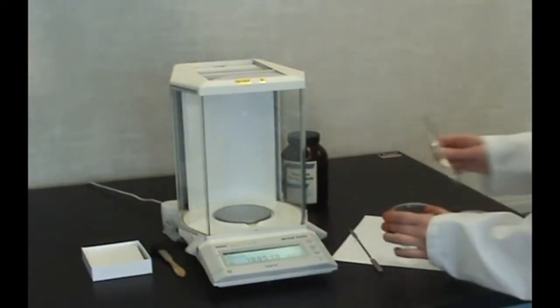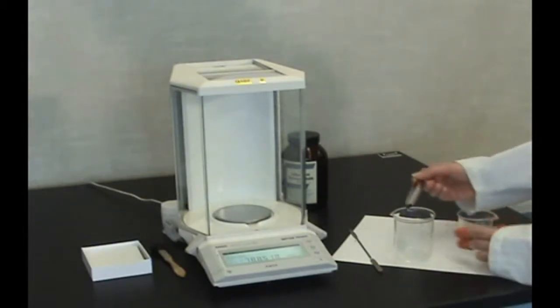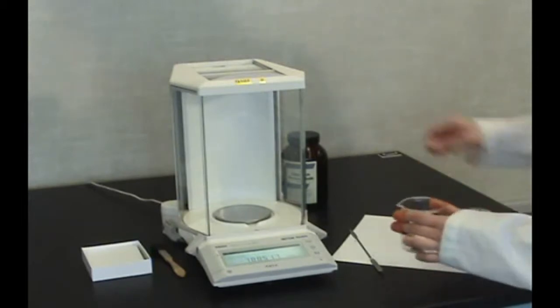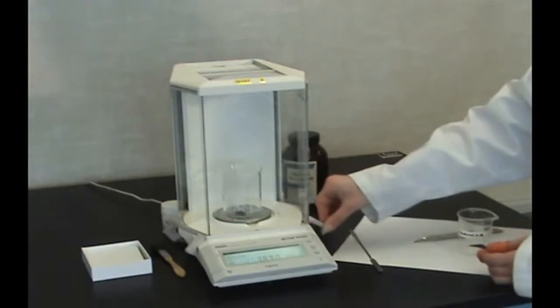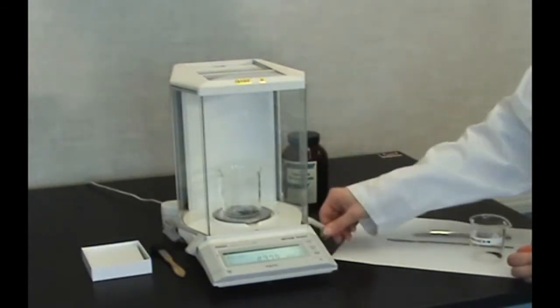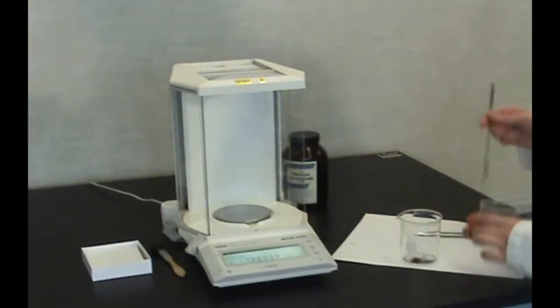Use a scoopula and microspatula for transferring the crystals. The scoopula is for a larger amount, while the microspatula is to add small amounts.